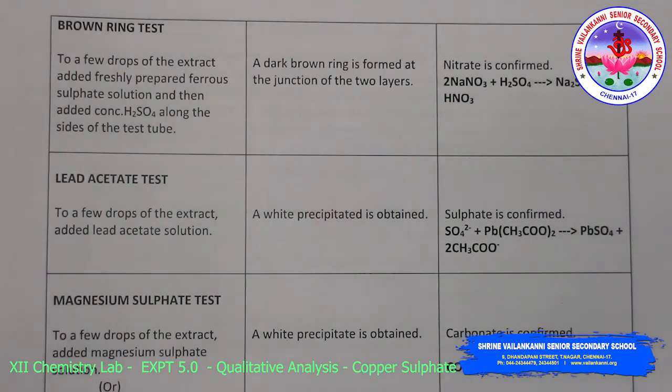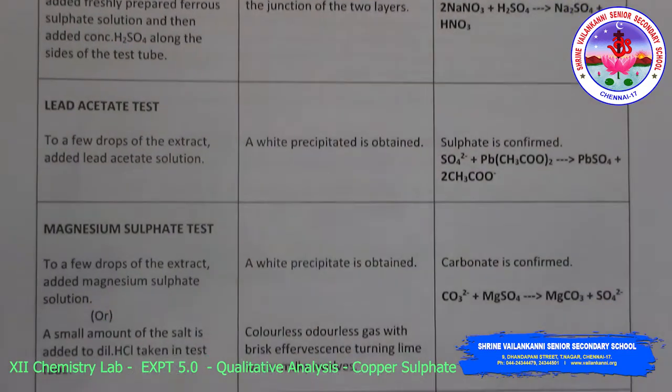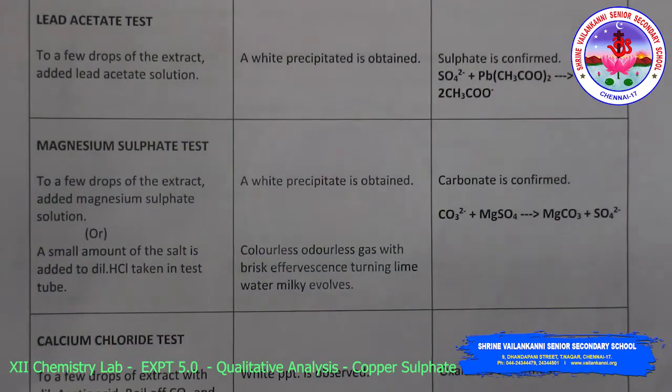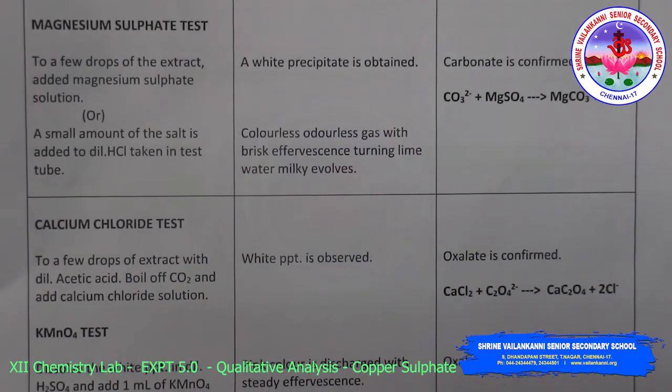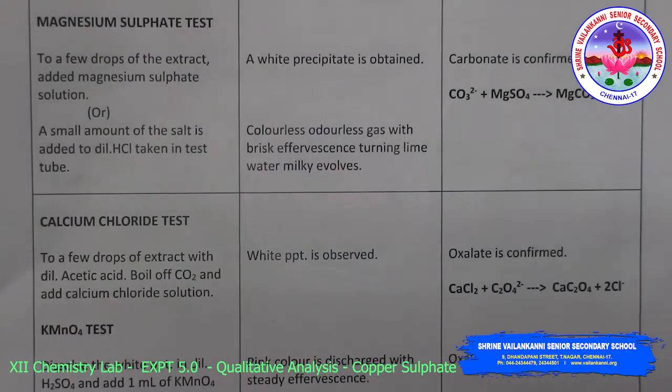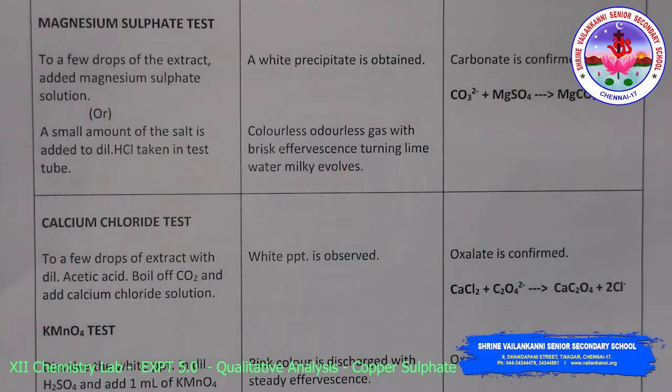Then the lead acetate test. To the extract add lead acetate solution; a white precipitate is obtained, and sulphate is confirmed. Then the magnesium sulphate test. To a few drops of extract add magnesium sulphate solution; a white precipitate is obtained, and carbonate is confirmed. Or a small amount of the salt is added to dilute HCl in a test tube. A colorless, odorless gas with brisk effervescence turning lime water milky evolves.